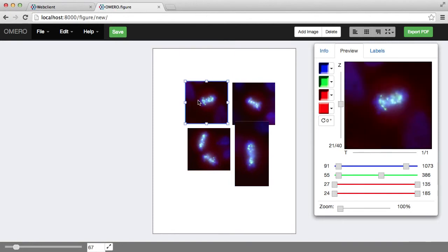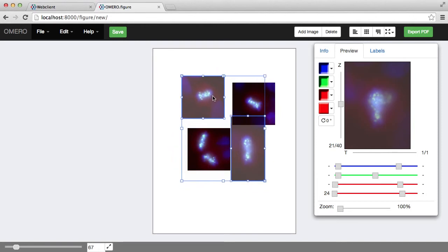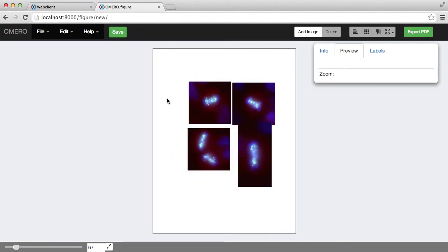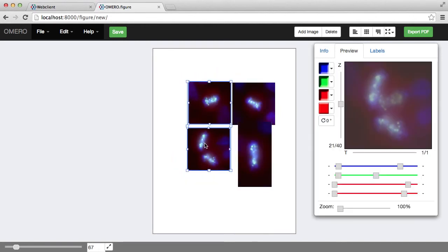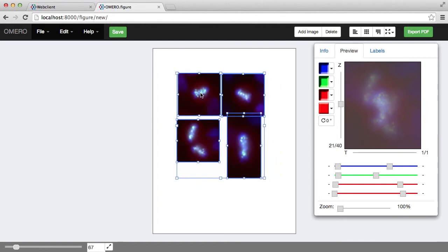I can select multiple images by Shift-clicking, or by dragging a section, or I can use a keyboard shortcut, Command-A, to select all of the panels.